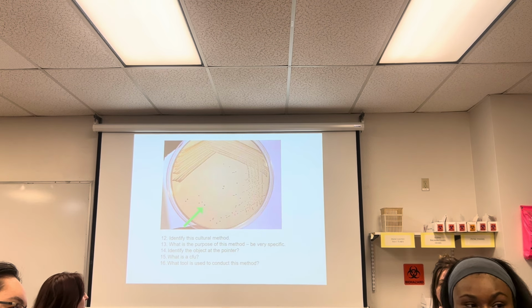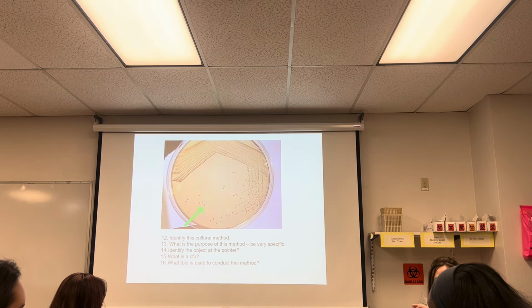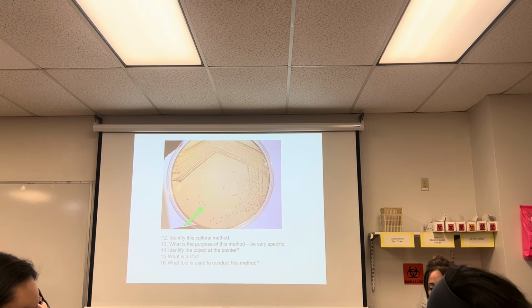Okay? All right, here we go. What tool is used to conduct this method? A loop. A loop is fine. You can say inoculating loop, but a loop is fine.